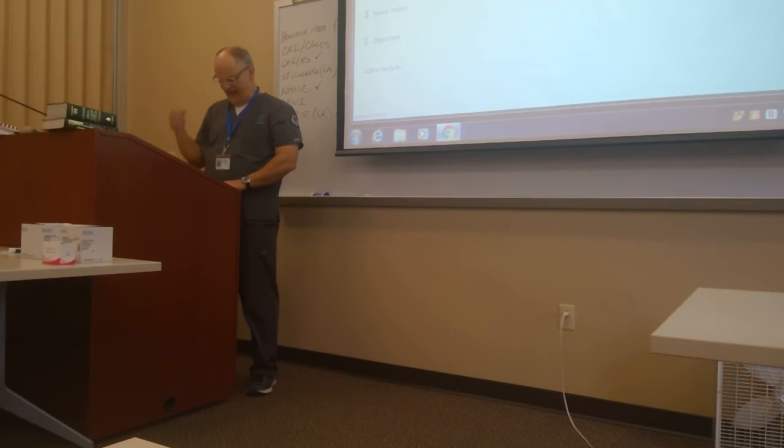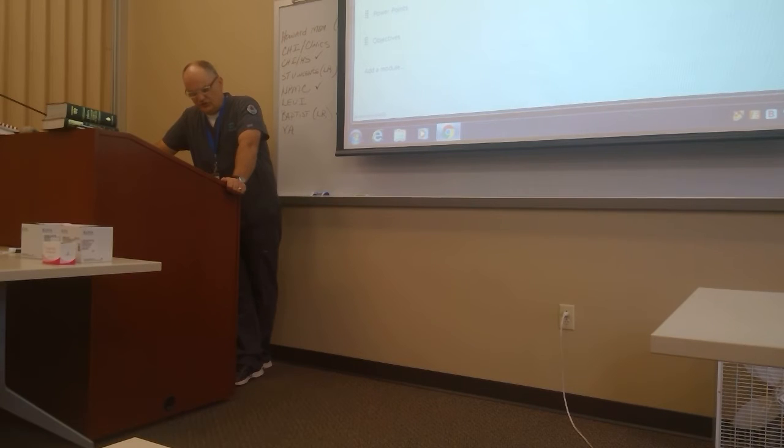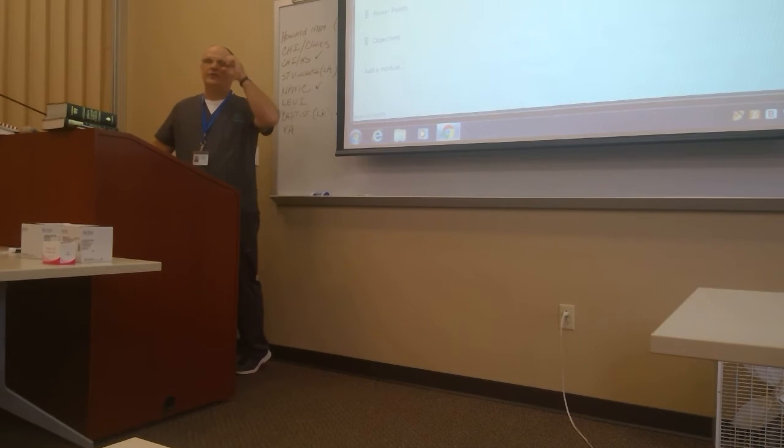And the only thing that I have really highlighted in my book that I want you to understand is in the right-hand column toward the bottom, there's a few lines there. It says the time of the call and the name of the person receiving the results must be documented according to the facility's policy. This has to do with the calling of critical results.